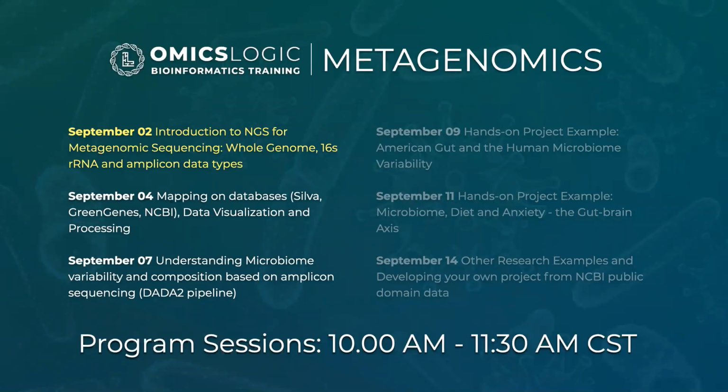So really today it's going to be an introduction to next generation sequencing for metagenomic sequencing, whole genome, 16S ribosomal RNA, and amplicon data type. So there's a variety of different ways to produce this data.